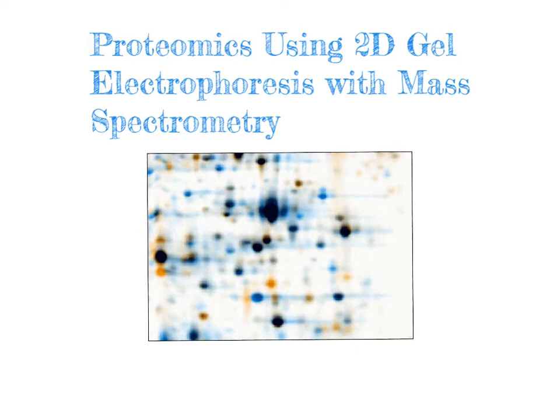And much like the evaluation of small molecules from the perspective of metabolomics gave a much more comprehensive view of the overall chemical impacts of treatments on a cell, likewise, proteomics will give us a much more comprehensive perspective than looking at just one protein from a cell. In the next few videos, we're going to focus on some of the common strategies for proteomics analysis.